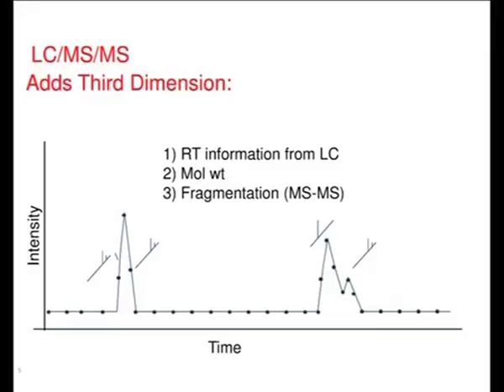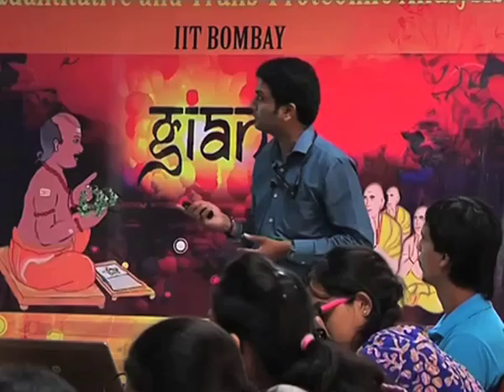Let us take the same example. The molecular weight of your compound is 490, and the interfering molecule also has a molecular weight of 490. You are getting an m/z of 491. But when you do the fragmentation, the product ions formed for the compound of interest and the interfering molecule will be different. Therefore, you have to focus on the product ion that is specific to your compound of interest. In that case, you can avoid detection of the interfering molecule, and you can quantitate your compound in the presence of different biological matrix or interfering molecules.